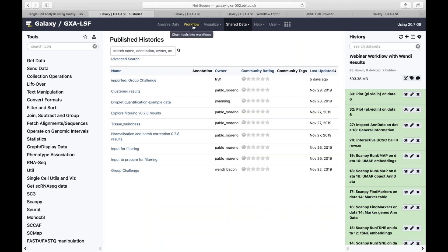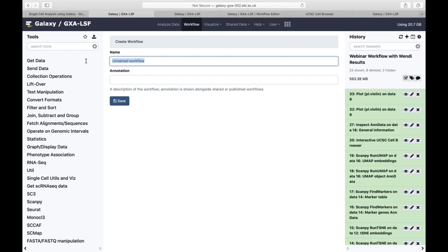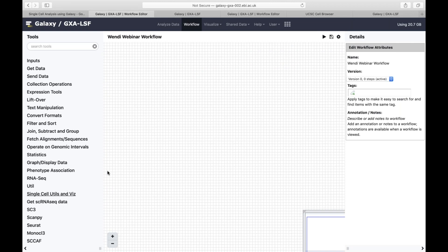Different things you can have: we have workflows and data histories. A workflow is where you're chaining your tools together, and we're going to go through making a workflow in this tutorial. The great thing about Galaxy is it does a great job of remembering everything that you do, so it's very important that you label things appropriately — but that's a topic for a different time.